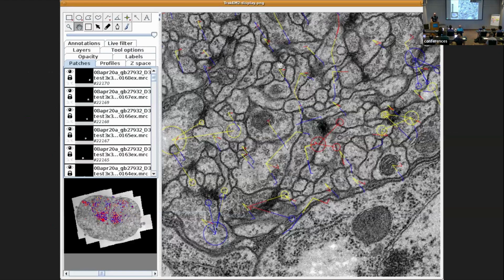Okay, but the tool actually works. And this is how it looks. You have the file called a section series. You have lots of tiles that you can manage, these tiles and image stacks.